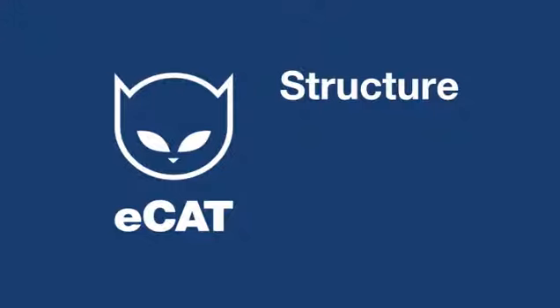Let's see what eCAT can do in comparison with wikis. Wikis don't offer any structure. You just have a page and you type text into it. eCAT lets you easily impose a structure to your data.